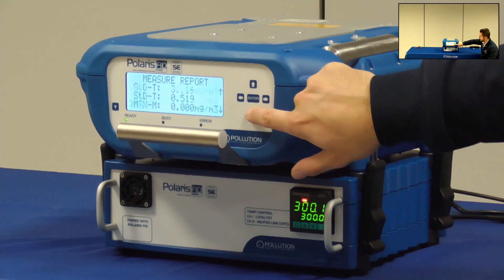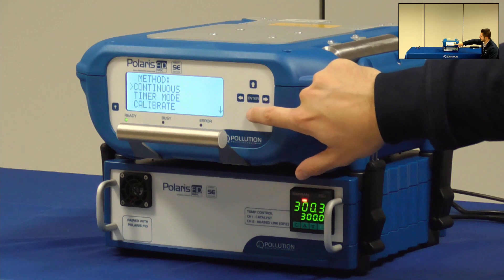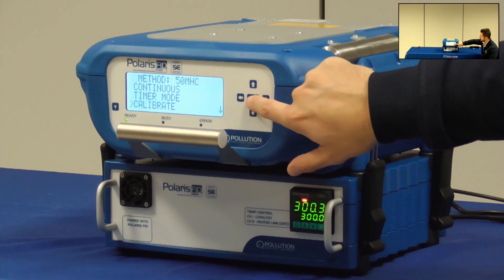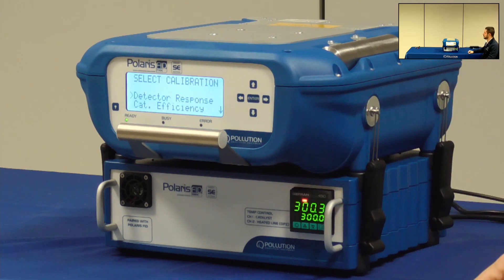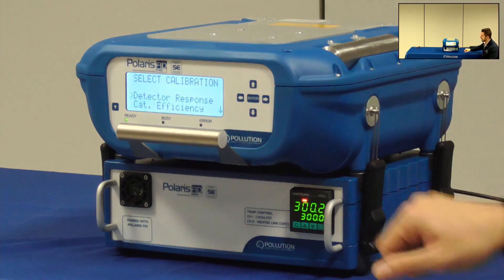Here are shown the average values. I press Continue, saving data — no — and then I can select Calibrate. Now on the screen you can choose between two options: detector response and cut efficiency.